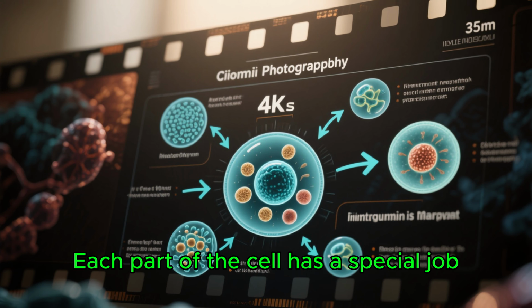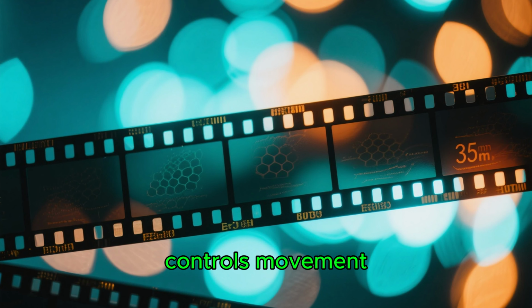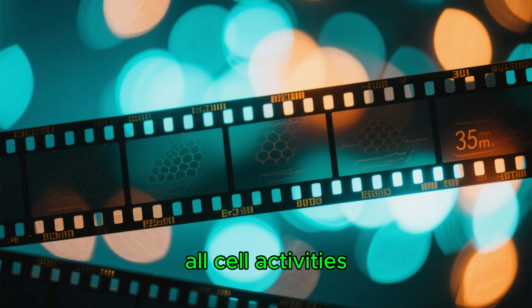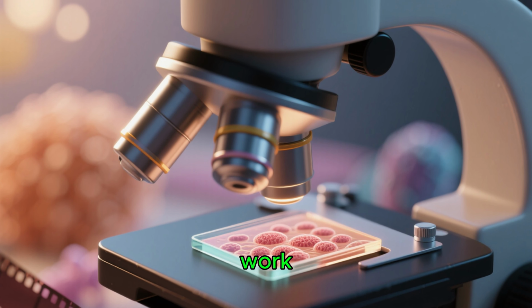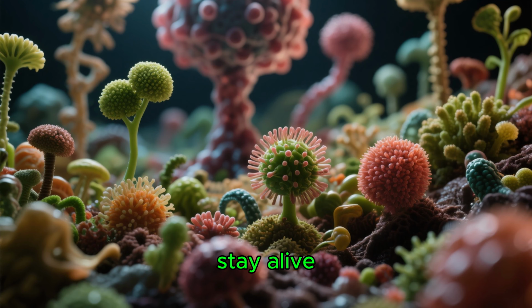Each part of the cell has a special job. The cell wall gives shape and protection. The cell membrane controls movement of substances. The cytoplasm holds cell parts, and the nucleus controls all cell activities. Using the microscope helps us see how cells are made and how they work. This is the first step in understanding how all living things grow, move, and stay alive.